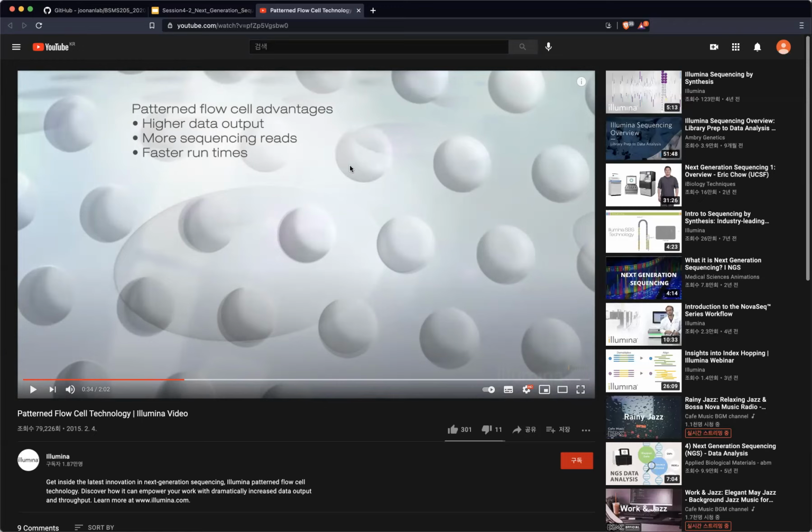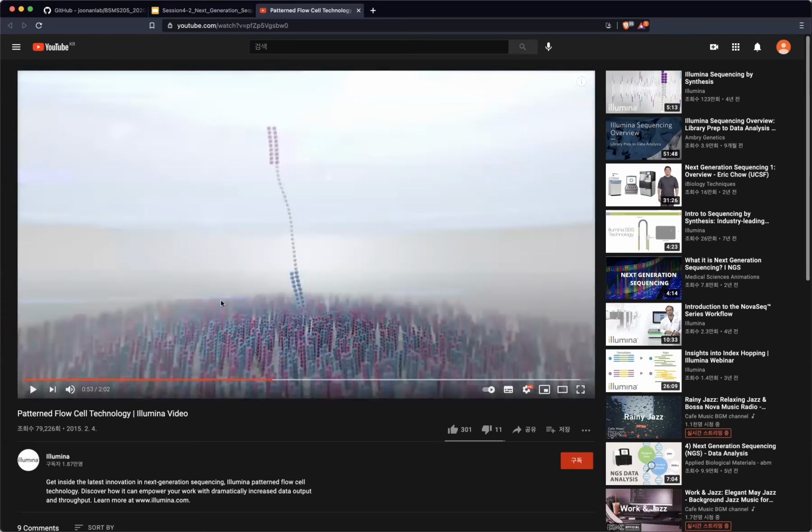So how does that happen? You basically make an exact concentration to put into your flow cell. If you put in too much, there is a possibility that two libraries bind to this area. So you have to make an accurate adjustment by calculating the molarity. Then you put one DNA library into this area, and once it gets there, it will start the amplification around these positions, right?